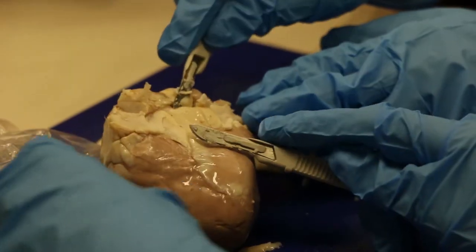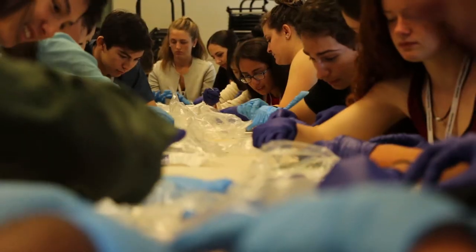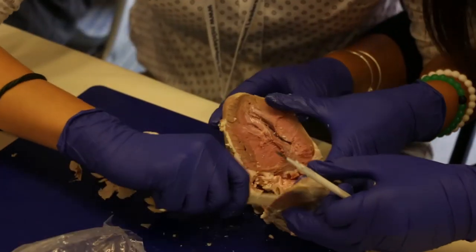So we're dissecting lamb hearts. At first we took off all the fat and then got a better look at the heart anatomy. Then what we did was cut the heart in half like a bagel, which is pretty funny.